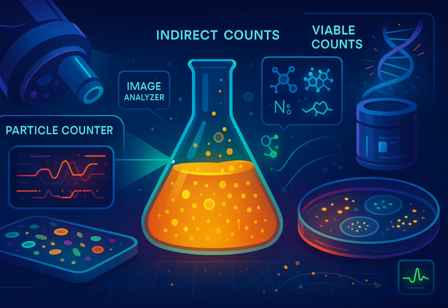Total nitrogen, total protein, nucleic acids. Yeah. Those are common. The idea is if you know roughly how much protein, say, is in an average cell or per gram of cells, you measure the total protein in your sample and estimate the biomass from that. And you do that. Usually collect the cells, wash them to get rid of medium interference, break them open, do a chemical assay for the component, often read on a spectrophotometer again.